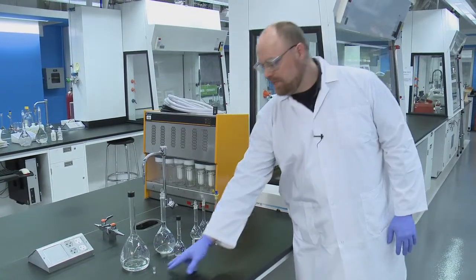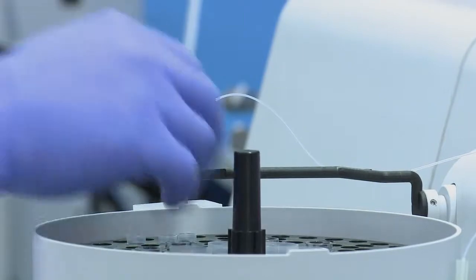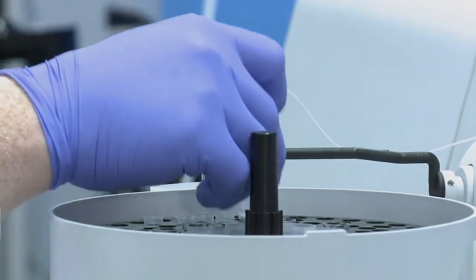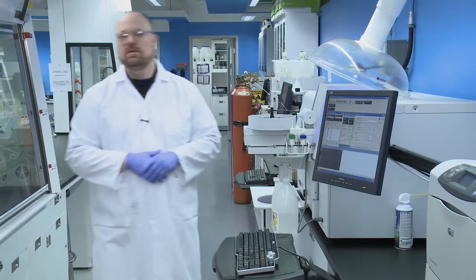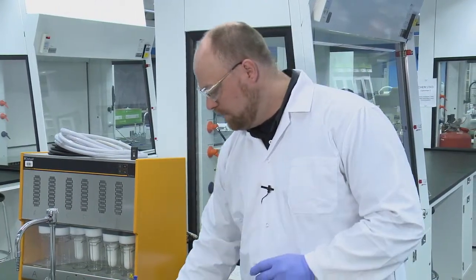you're going to take the sample vials and you're going to load them into the auto sampler of the spectrometer, putting them in the correct position that's given in your lab manual or by your TA or the lab coordinator.